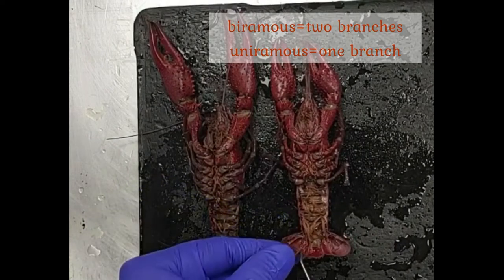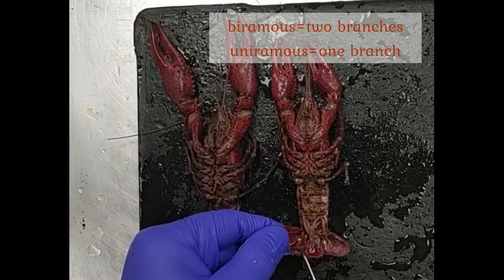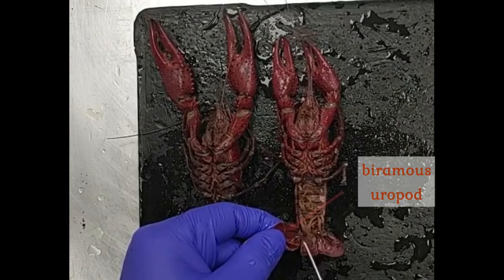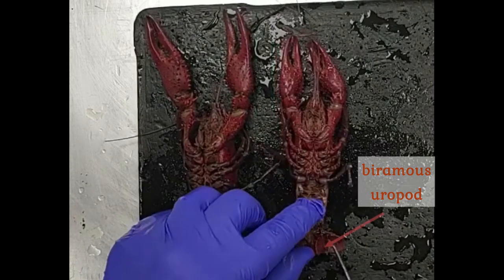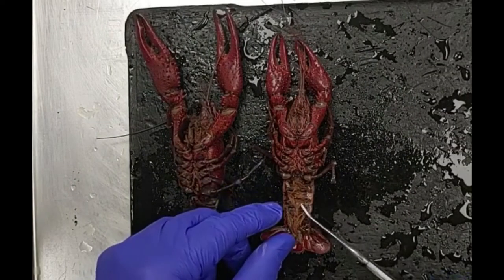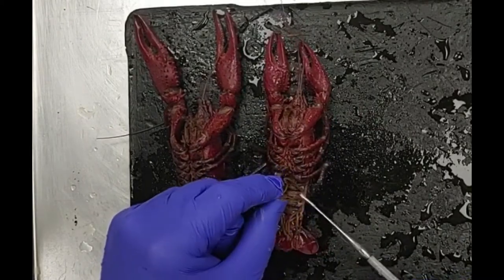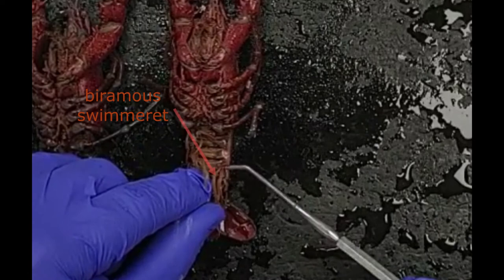Another defining characteristic of crustaceans is that they have biramous, or two-branched, appendages. Down here on the tail, we see these uropods — these tail appendages. It looks like we have two pairs, but we only have one pair because there are two branches: a single base with two distal branches. So this is a biramous uropod — one on the left, one on the right. In the middle is the unpaired telson. Each swimmerette also has two branches, as you can see clearly here.